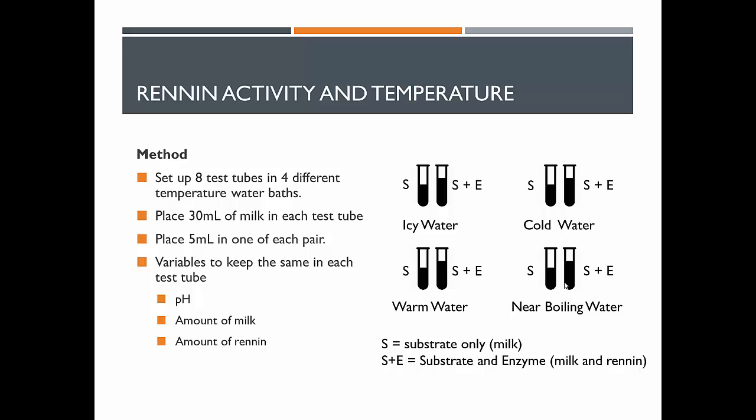So we're looking at least somewhere over 65 degrees there. Alright, so what we're going to do is place 30 mils in each test tube. So we've got our substrate, which is the milk. We're going to place 30 mils of it in here.